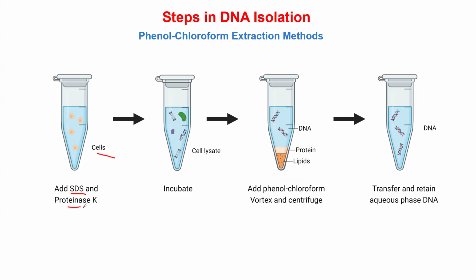Proteinase is an enzyme that degrades proteins in the cell. Then you incubate the lysed cell at around 65 degrees centigrade.